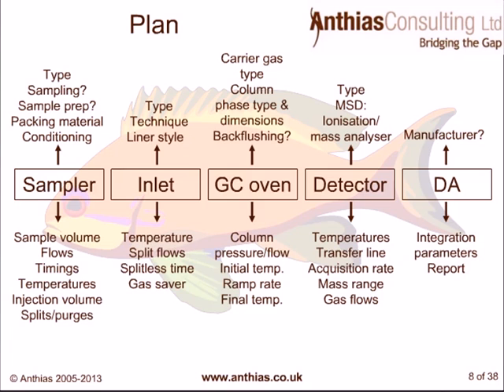So all of those are going to make us think about actually, can we automate it to our GCMS system first of all? If we are doing it offline, again, optimizing all the different parameters of that. And if we are doing it online, connected to our GCMS instrument, making sure that it works, because of course that sampler may be from a different manufacturer than the rest of our GCMS equipment.